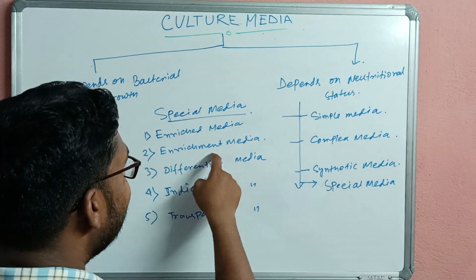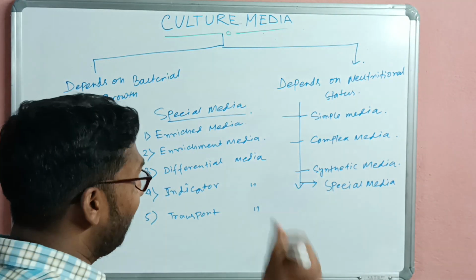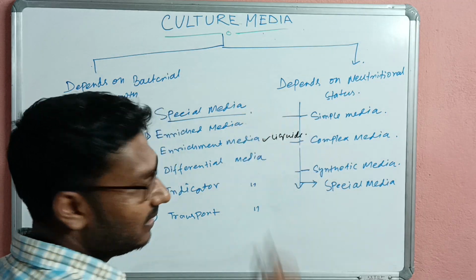Enrichment media is first of all a liquid media.